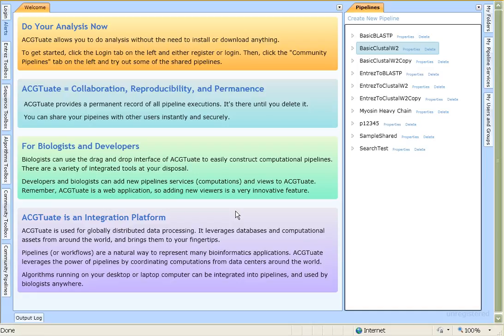We distribute a polling server that runs on your computer, and then it polls for requests, and then it invokes your algorithm, and it invokes your algorithm just through a simple command line protocol. So it's very easy to wrap, even if you're not an expert programmer. It's easy to wrap services that are running on your computer so that other people can use them.